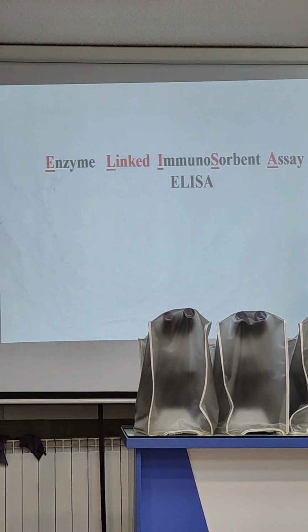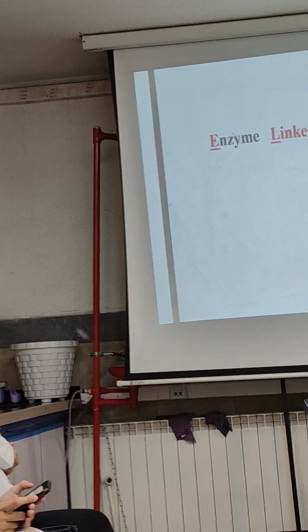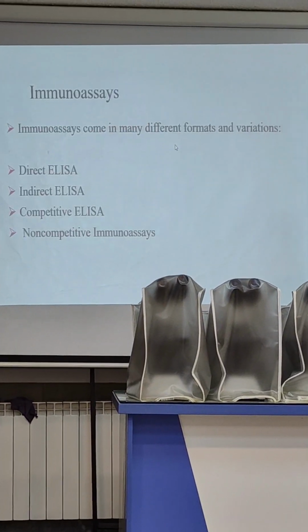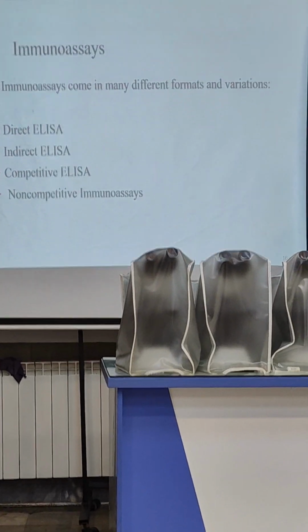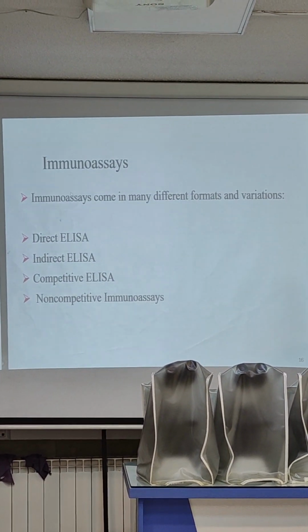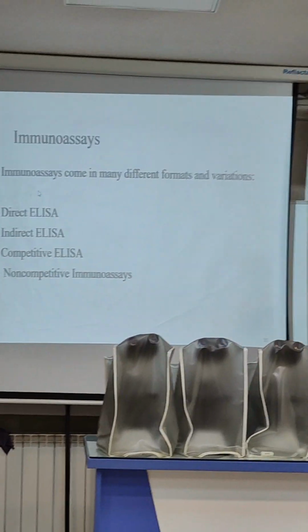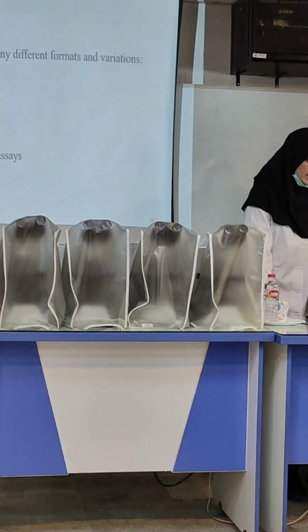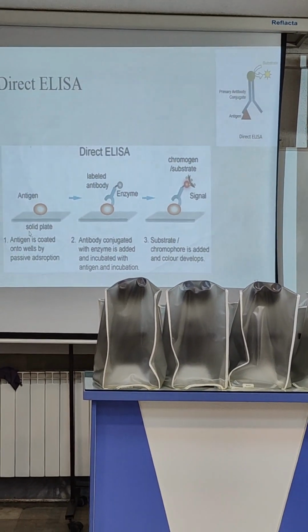And about the ELISA: ELISA is the abbreviation of enzyme linked immunosorbent assay, and I will describe the origin of this abbreviation. At first, I want to describe that immunoassay can be present in different forms: direct ELISA, indirect ELISA, competitive and non-competitive. So, what does it mean?